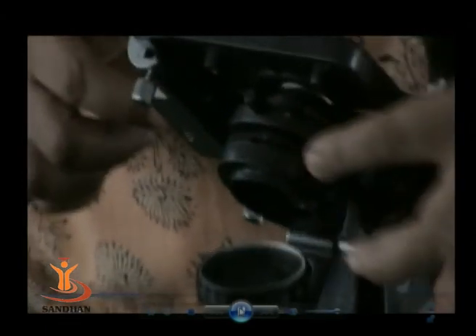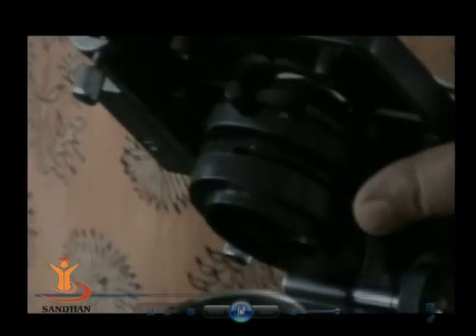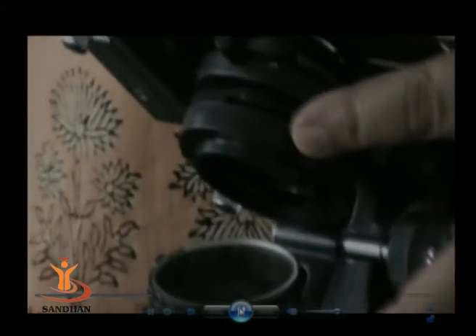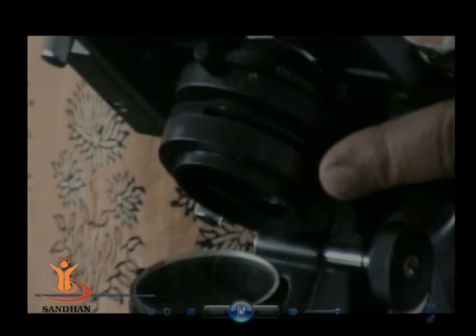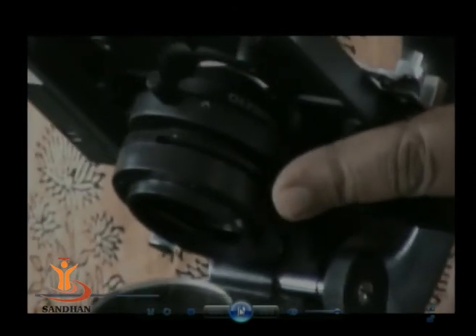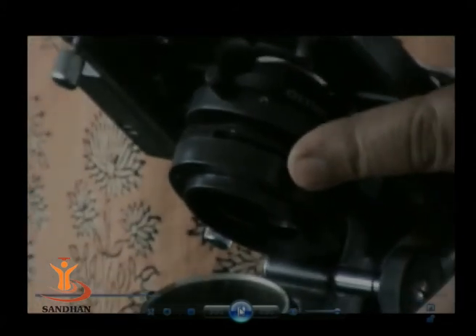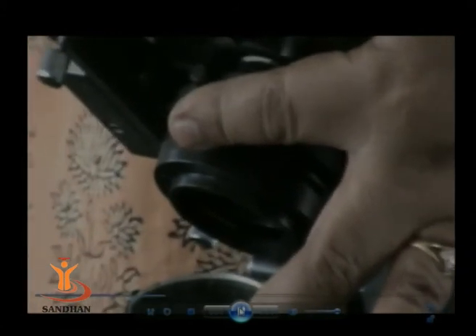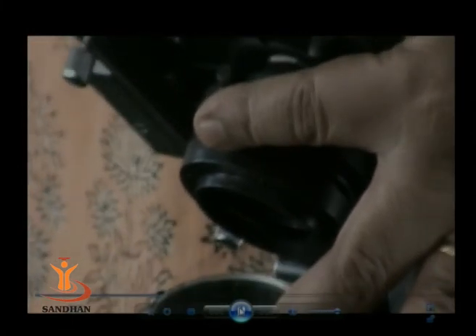You can see this is the diaphragm, which can be kept open or closed or partially open, once again depending upon the requirement. When it is fully open, it will allow the full light to enter the objective lens. If it is partially open, limited light. If it is completely closed, no light or very limited light will enter the objective lens.